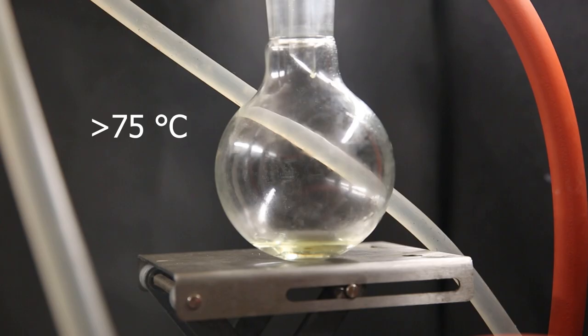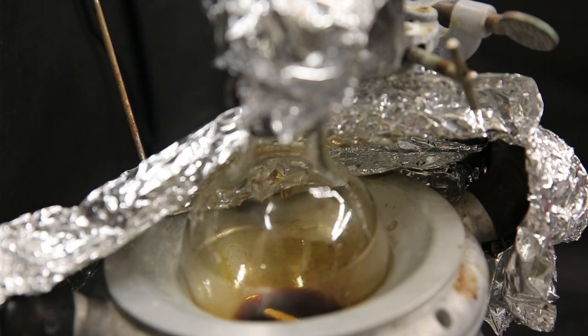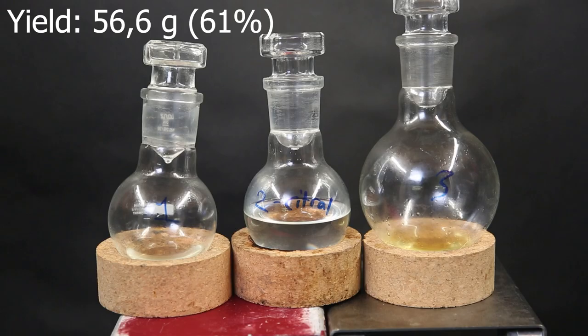When nothing more came over, all that was left in the flask was some red oil. And in the end, I am left with 3 fractions, of which fraction 2 should contain mostly citral. The weight of the second fraction was 56.6g, which is a yield of about 61%. Now the next step is chemical modification.